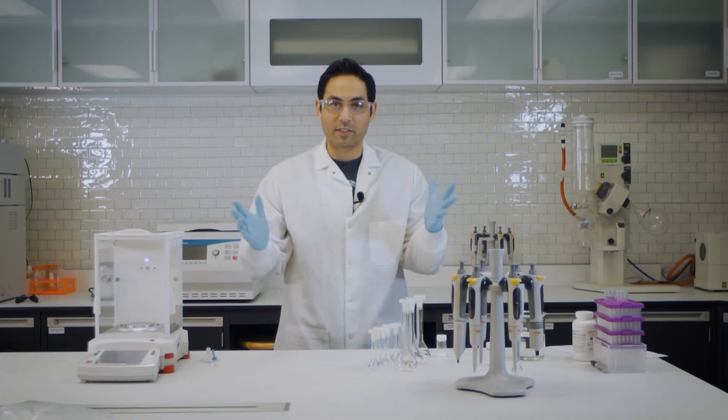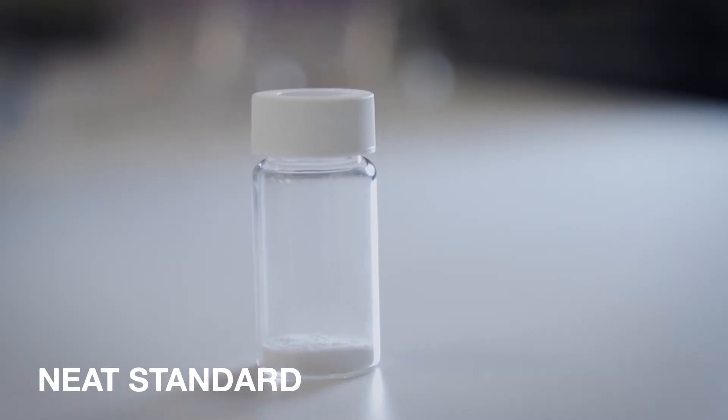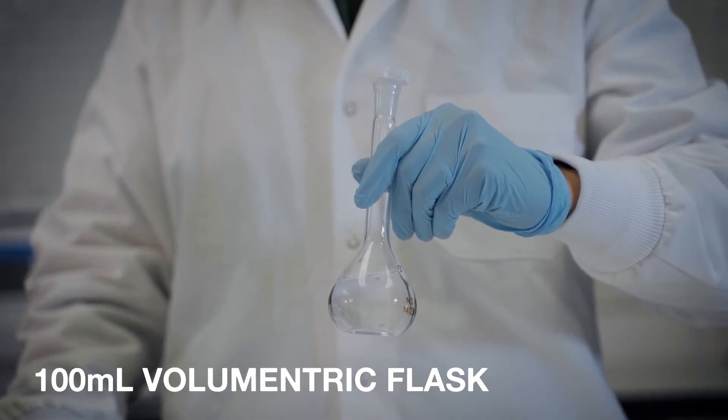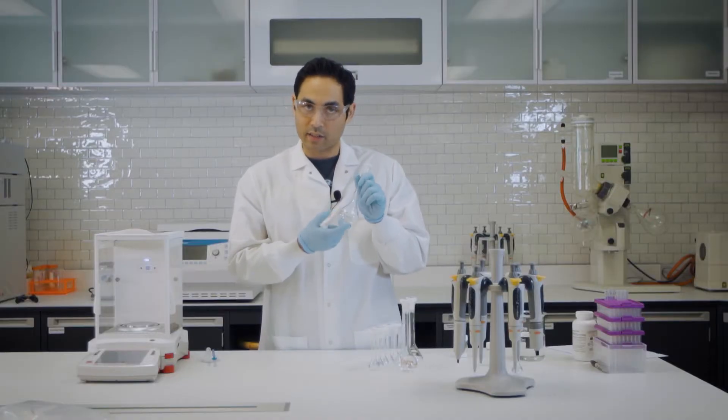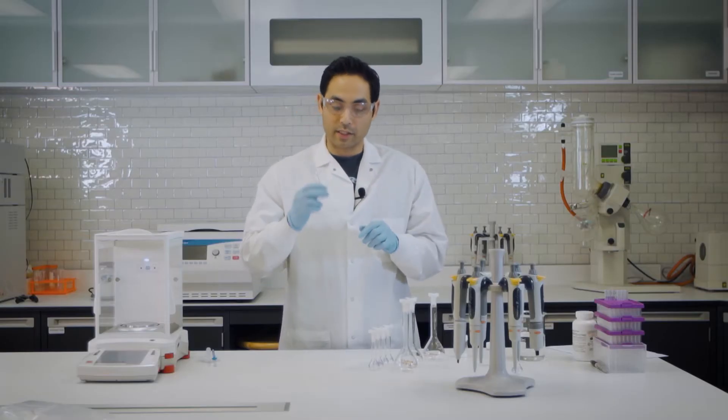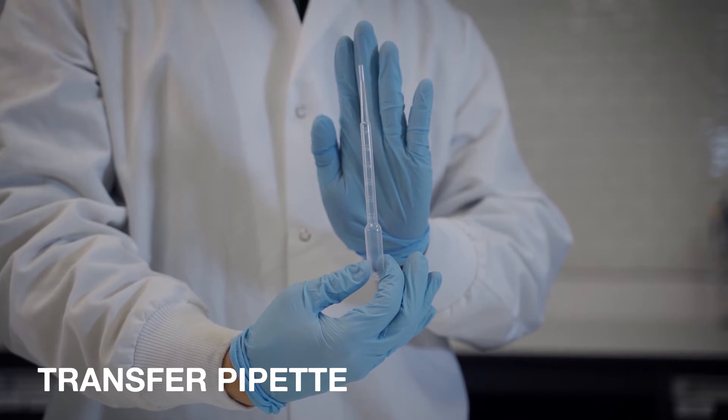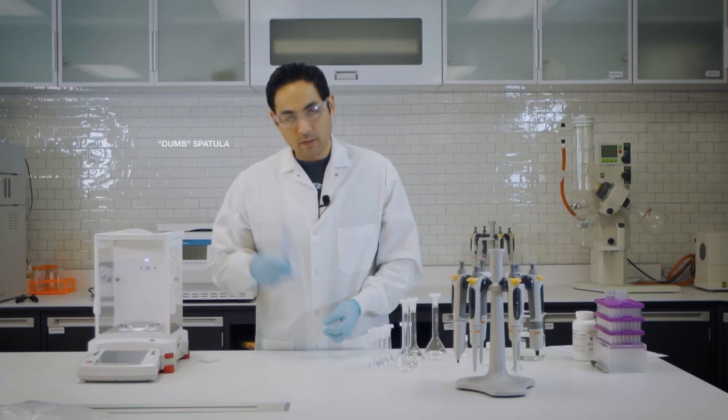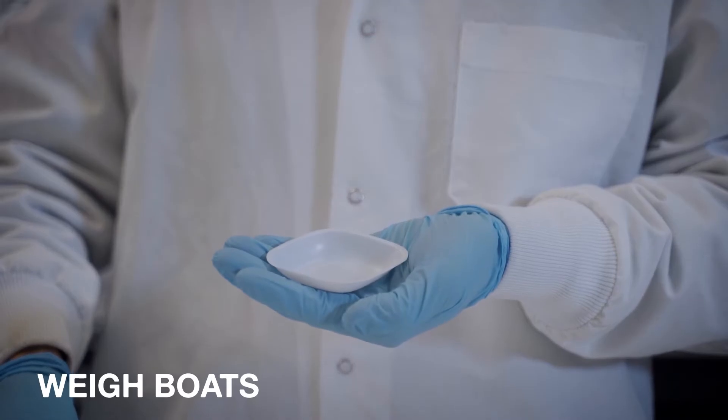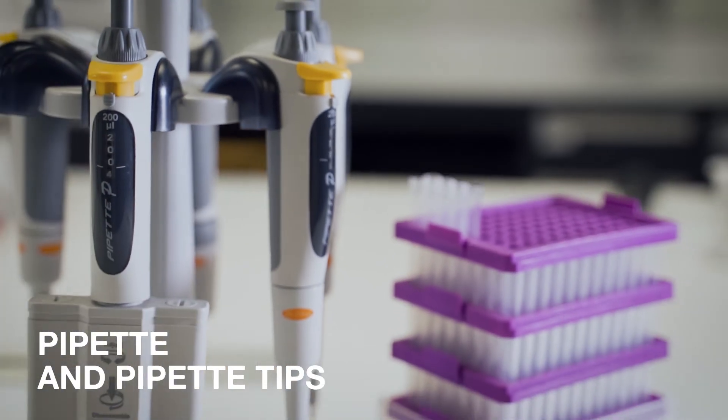Let's talk about materials. What do we need to build a cal curve? Some NEAT standard, 100 ml volumetric flask - this is going to be for the stock solution. A bunch of 10 ml volumetric flasks - these are going to be for the individual calibration points. Transfer pipette, very handy. Spatula, weigh boats, balance, pipette and pipette tip. So those are all the items that you're going to need.